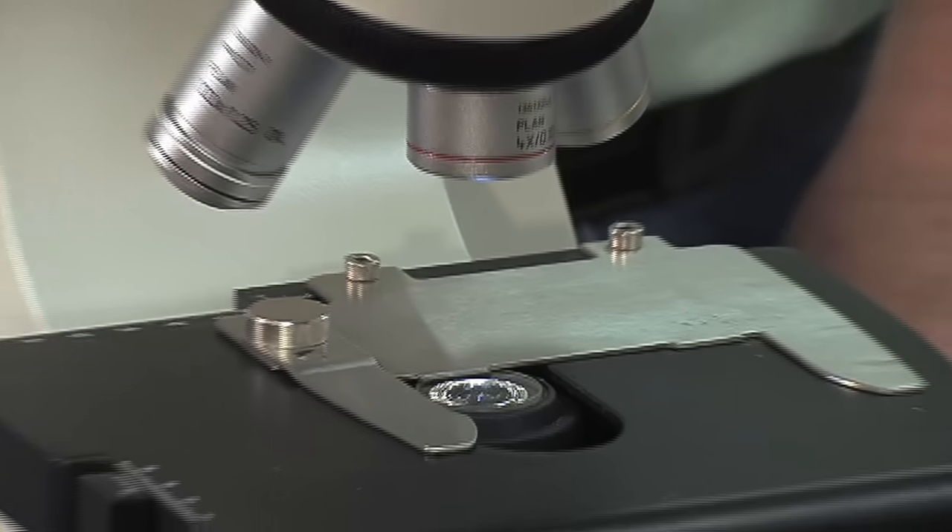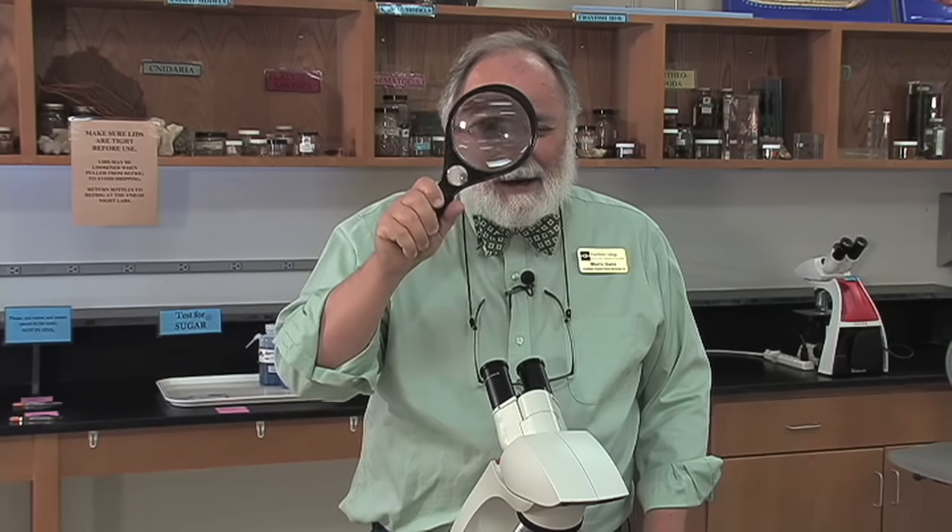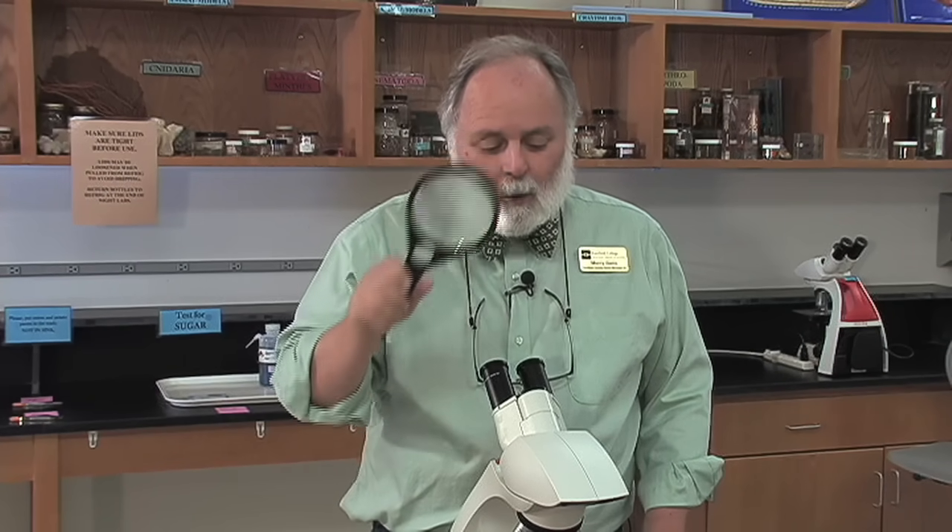Before we talk about the parts of the microscope, let's talk about what the microscope is going to do. The microscope uses a series of lenses to magnify an object. This hand lens will magnify up to 20 or 30 times, but we want the microscope to magnify up to 400 times. To do that, it's going to use more than one lens — a series of lenses.